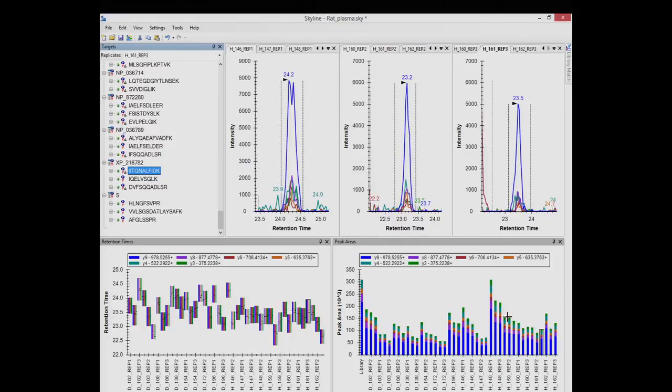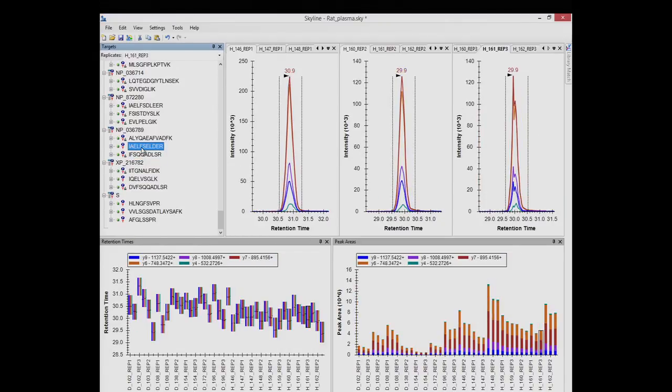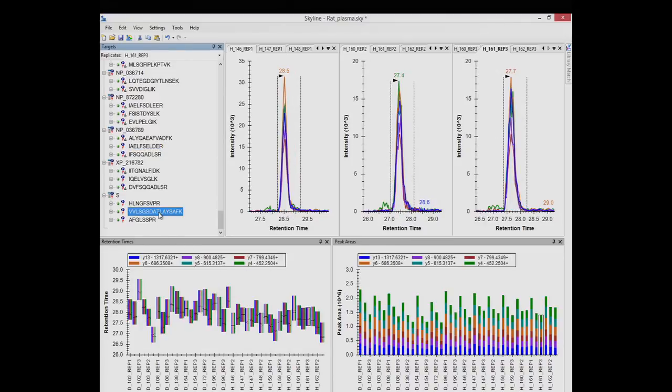You can see a similar decline, and you have to look in triplets because these are biological subjects, so we're not expecting them all to be the same. But if you look at triplets, you can see that frequently there's a decline going from forward to backward. So yeah, this one too. So that's an indication that the same thing that I'm seeing in here is repeated in my subjects or in my actual analyte peptides.